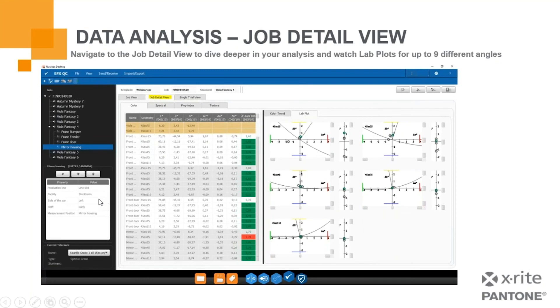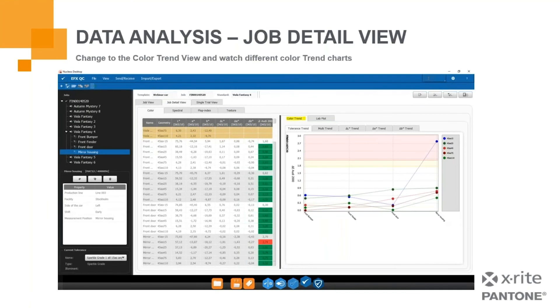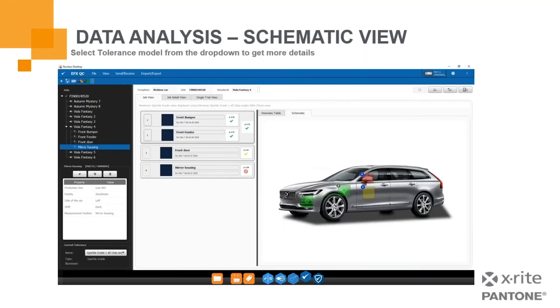With the software, we have the ability to gather and correlate information across different angles that are interesting or primary to your needs, so you can monitor and see the travel of your color. We can switch views and look at trends to see where we may need to touch on a particular product or process to improve it. For the automotive market, we have the ability to create jobs with loadable images to build a workflow dictating what you're measuring, when you measure it, and what's next.